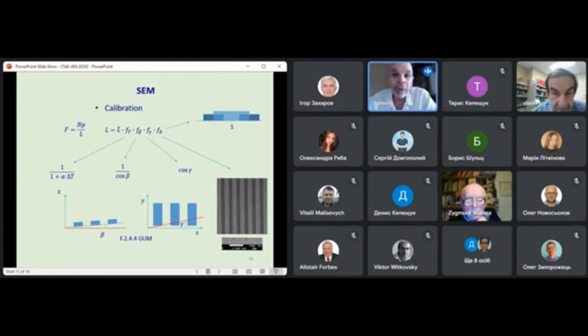Okay, thank you very much. And also, using other assumptions, like using other distributions, would imply that the calculation procedure would be a little more difficult or a little easier. In this case, the easiest way would be to use rectangular distributions. Okay, thank you.